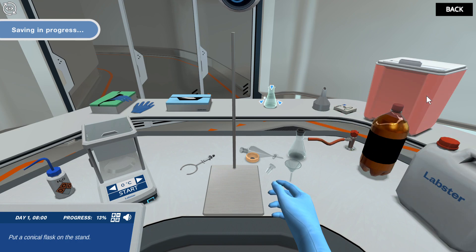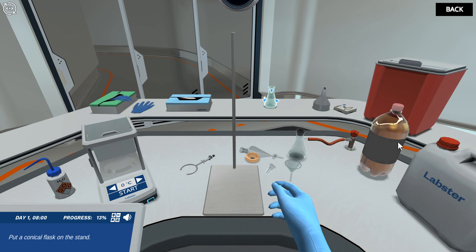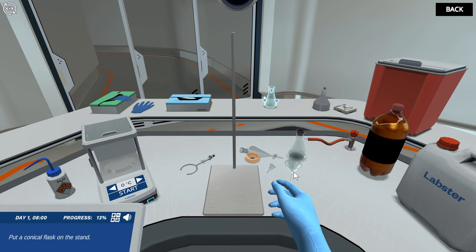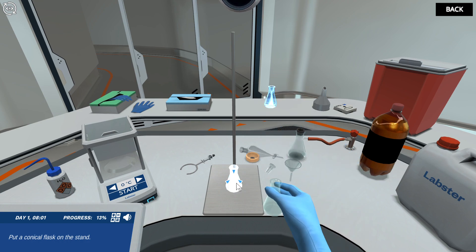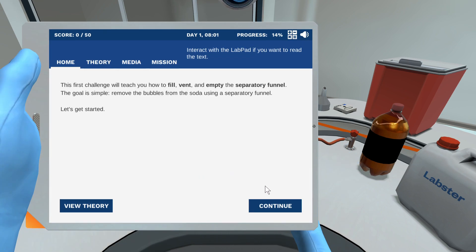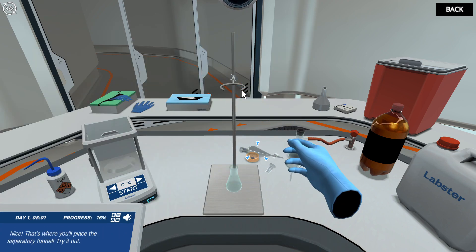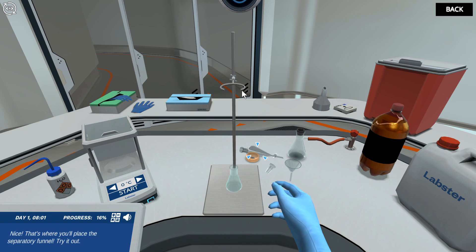Put a conical flask on the stand. Now pick up the clamp from the workbench and fasten it onto the stand. That's where you'll place the separatory funnel — try it out.